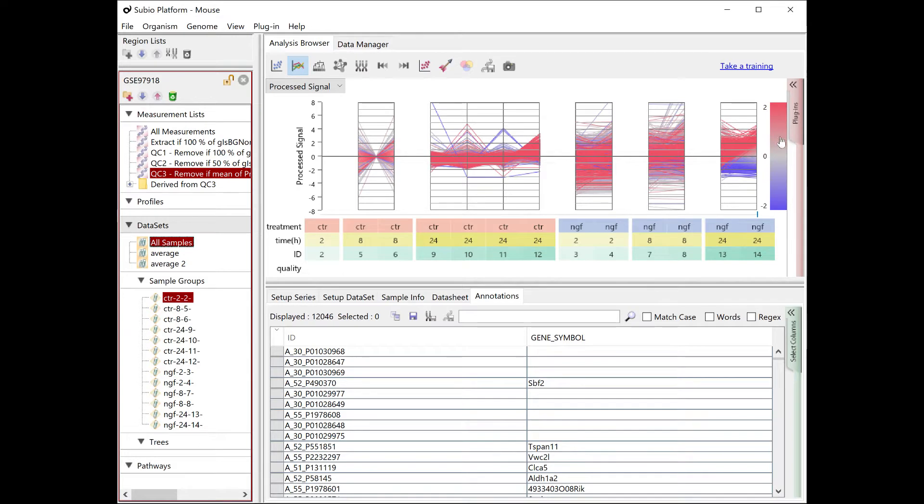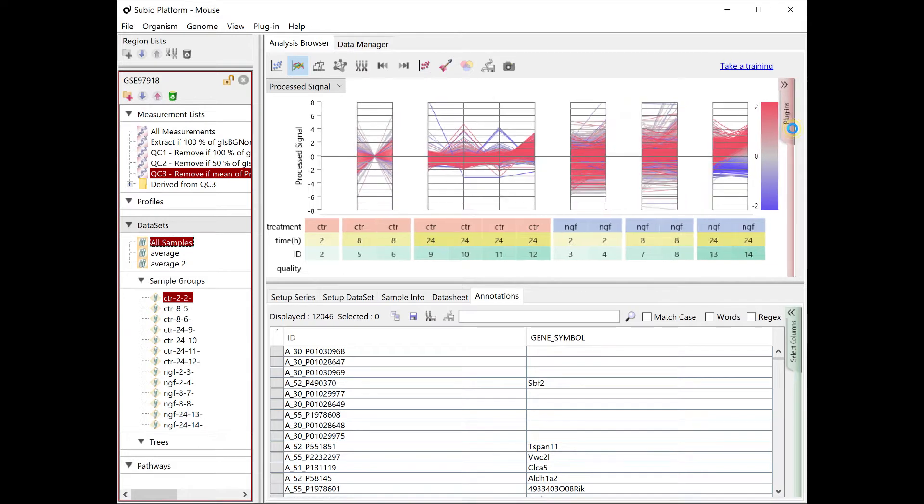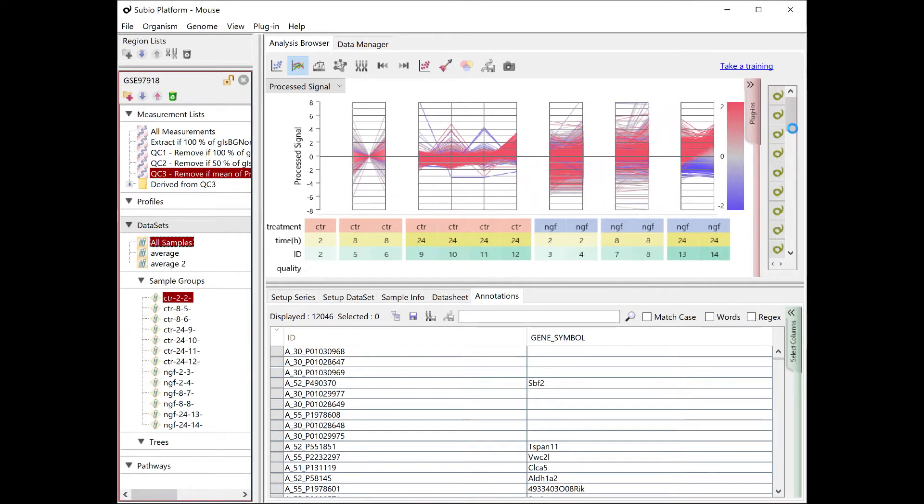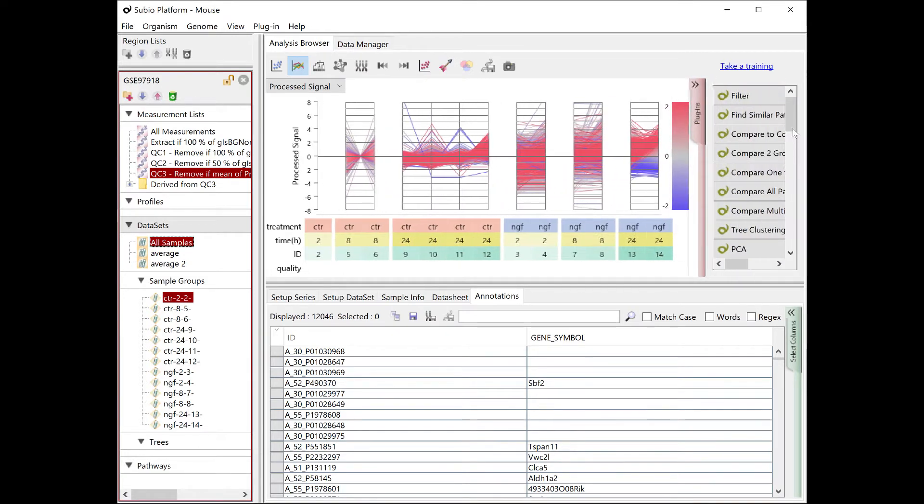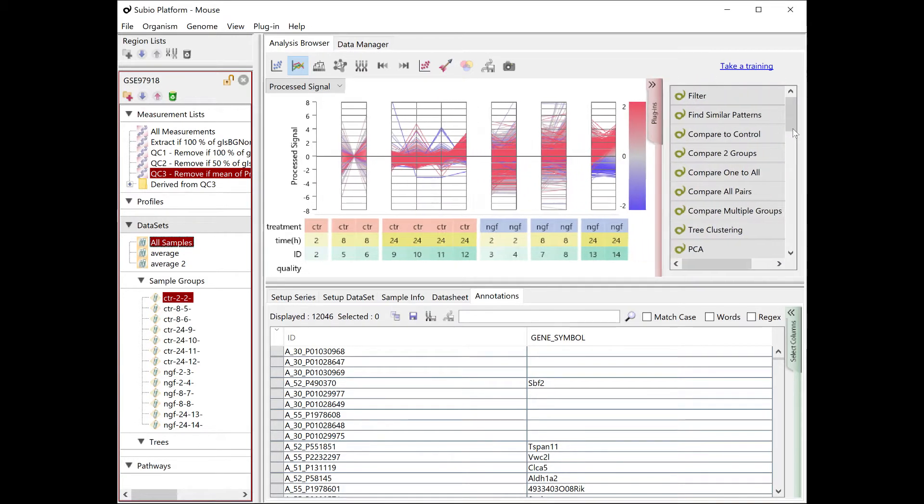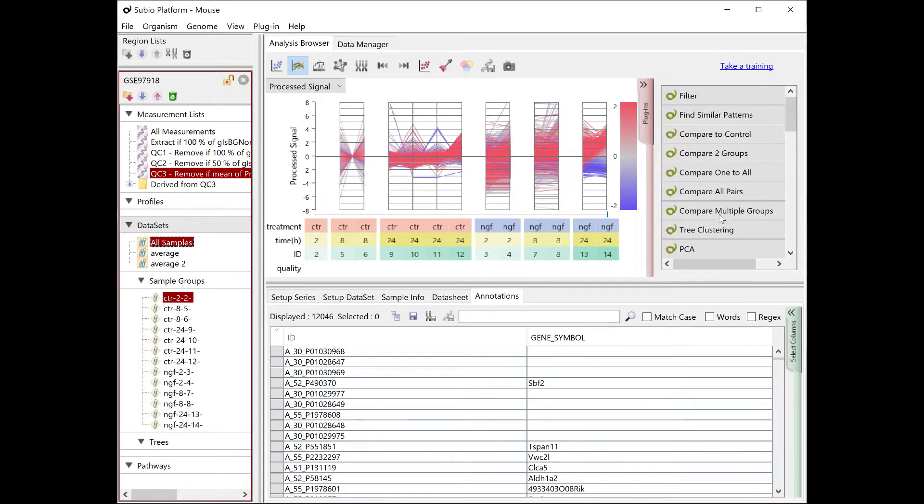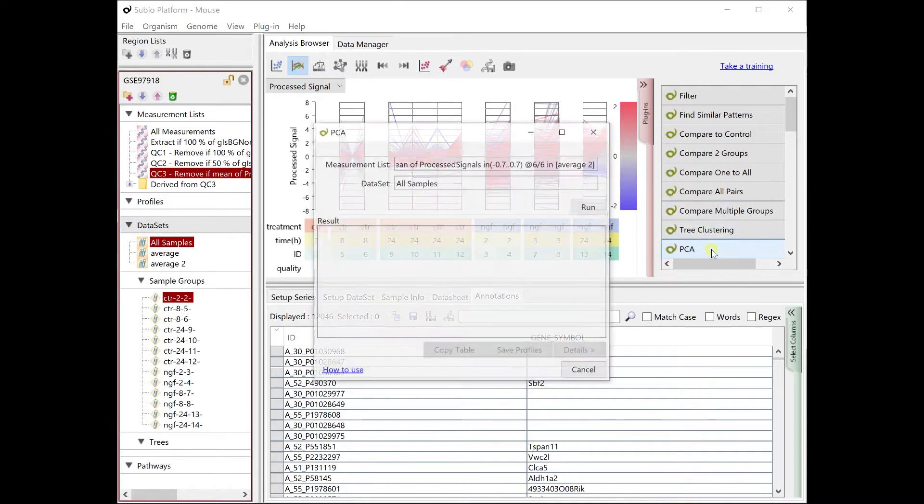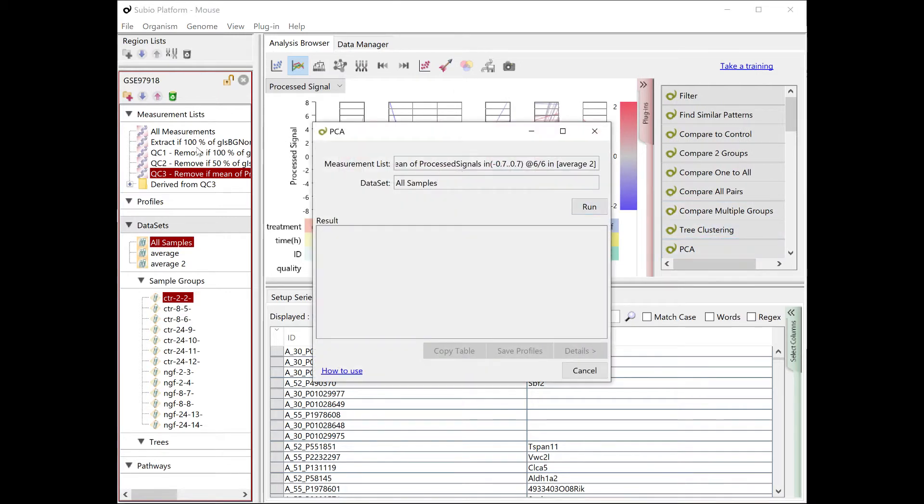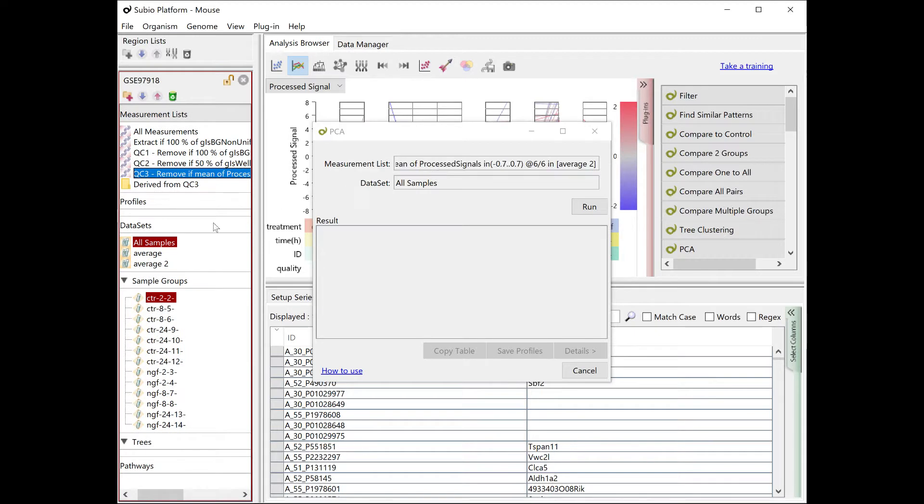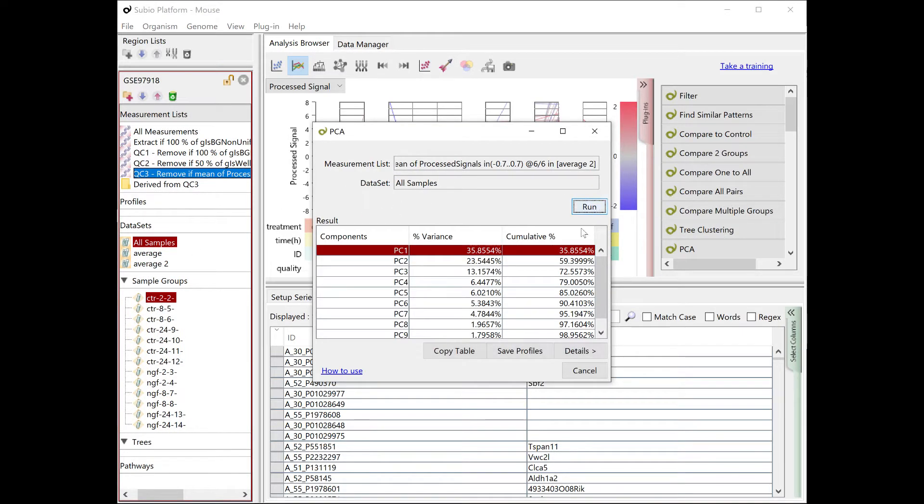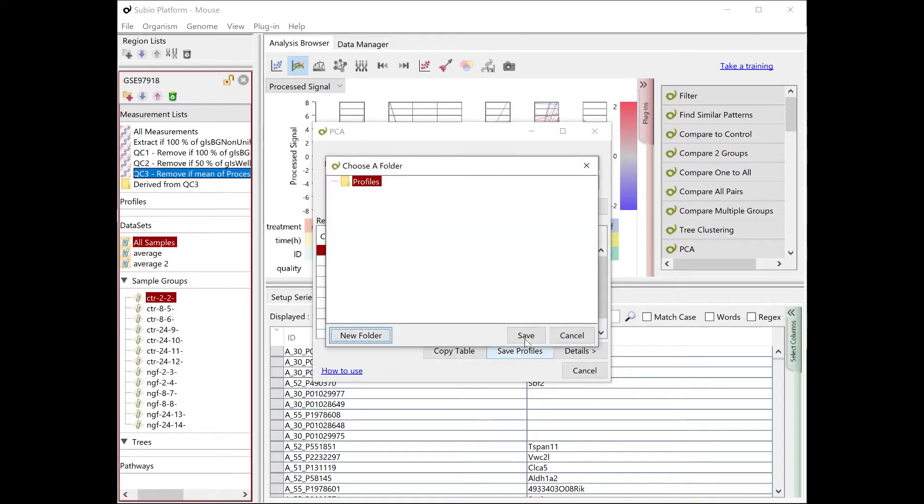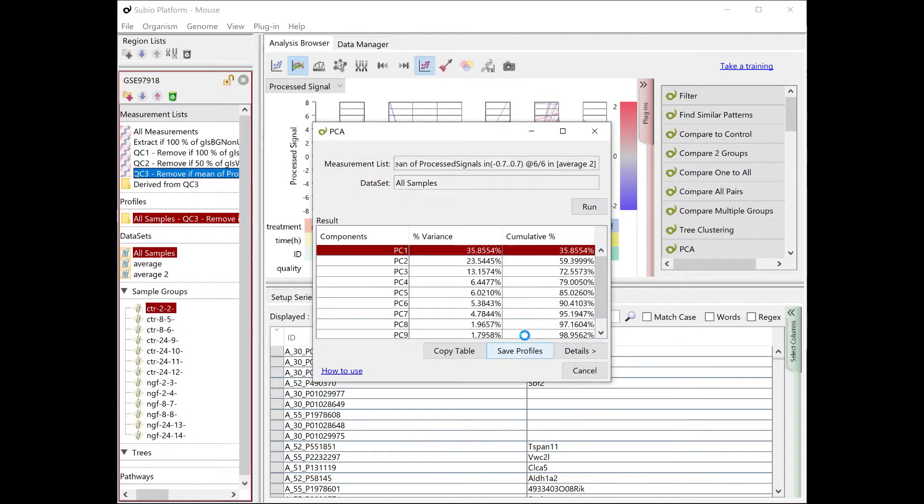If you select the All Samples dataset, you see the replicate samples in each group. Run the PCA tool with the QC3 list and the All Samples dataset. The first three principal components capture more than 70% of the variance.